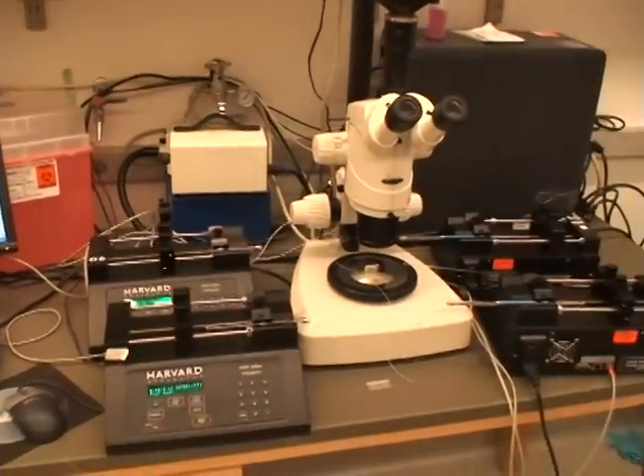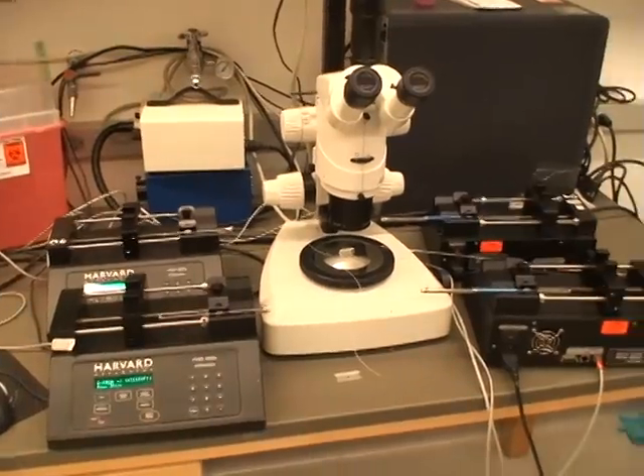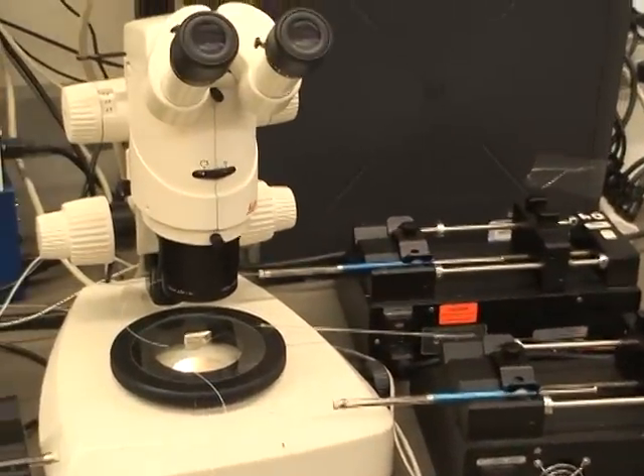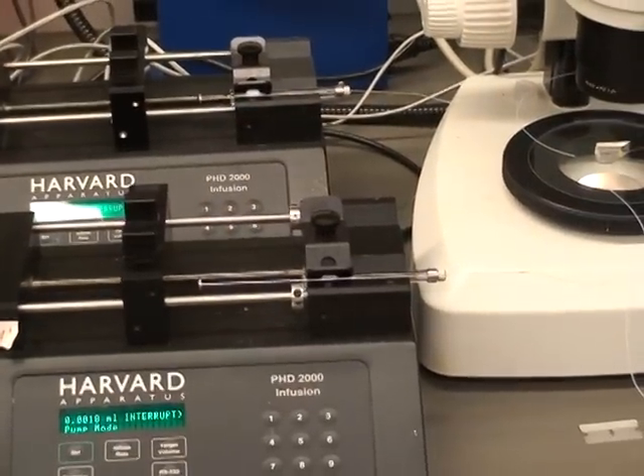Over here is the whole setup — four syringe pumps and the stereoscope. We have four syringes: the protein syringe is here, the buffer syringe back here, and the carrier fluid here up front, which is FC40.